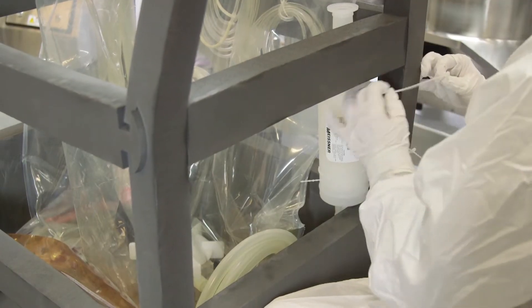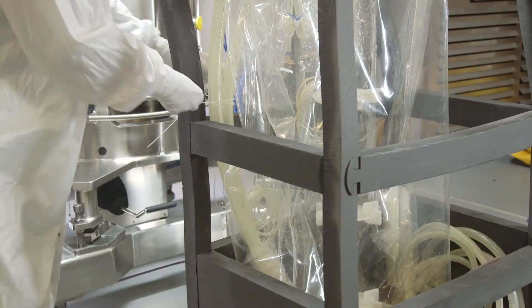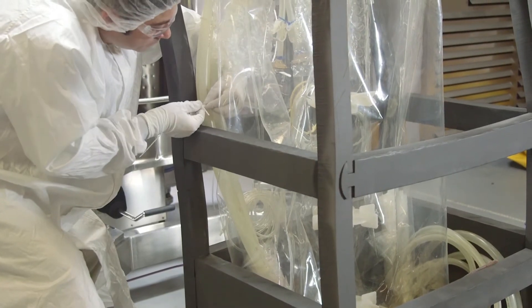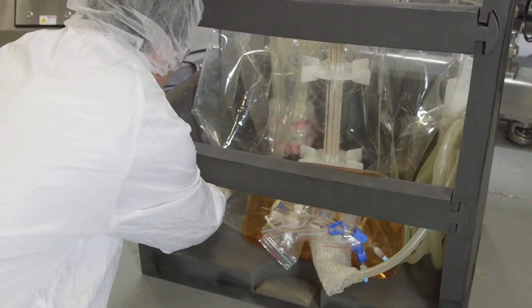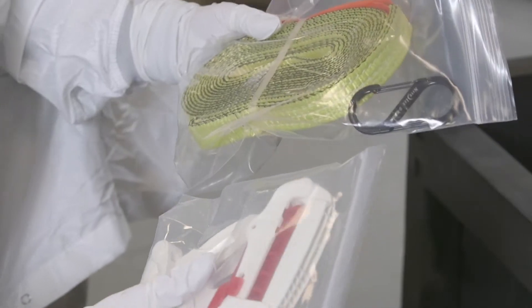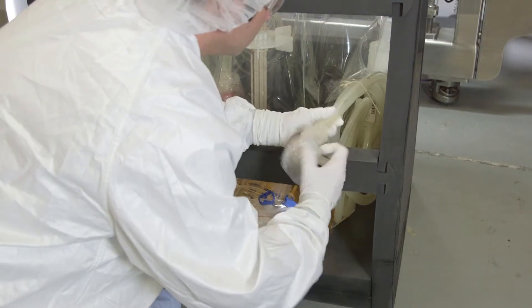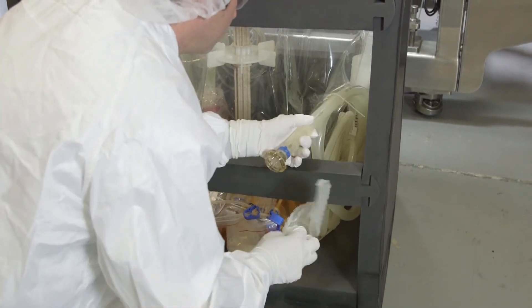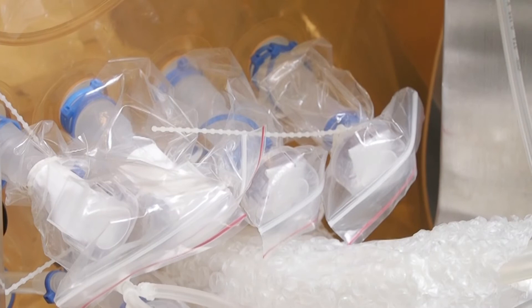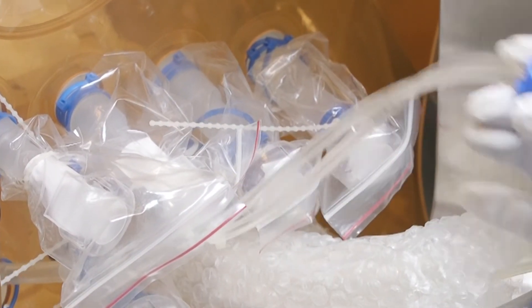Remove the sparge filter attached to the back corner of the foam frame. Locate the exhaust tubing and remove the cable ties. Pull out the package with three clamps and a lifting strap at the bottom and keep it nearby. At the front, remove bubble wrap from the probe ports at the base of the disposable bag. Keep the protective plastic covering the probe ports in place until the probes are installed.